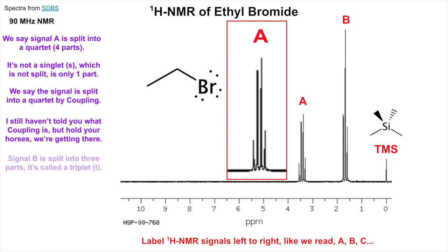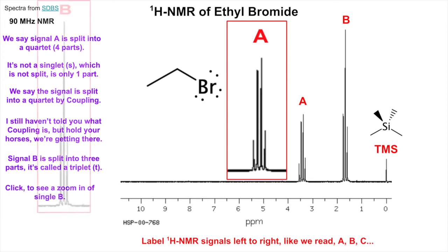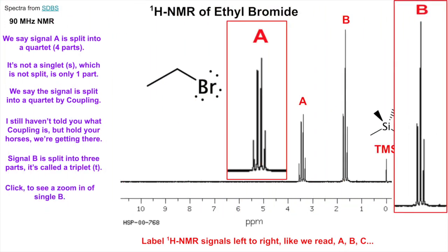Signal B is split into three parts - it's called a triplet. Zooming in on B, you can see it's short, tall, short. You notice a pattern: they're taller in the middle. We'll discuss that later. It's a triplet.